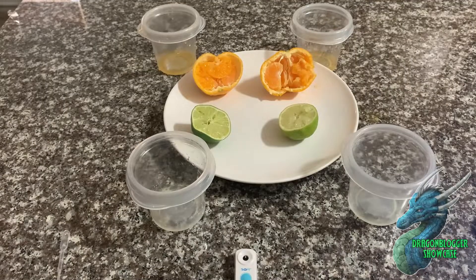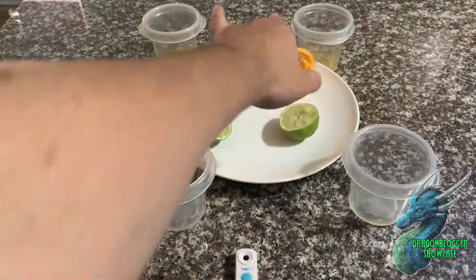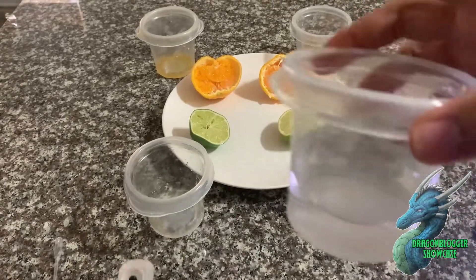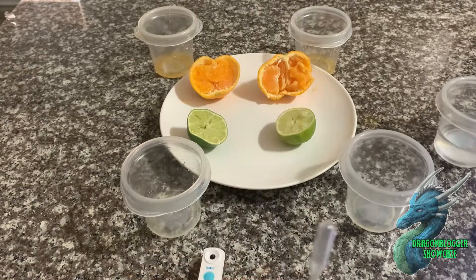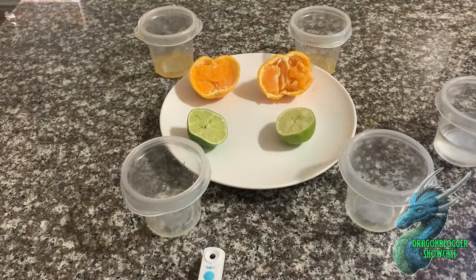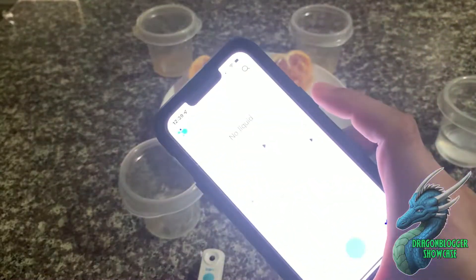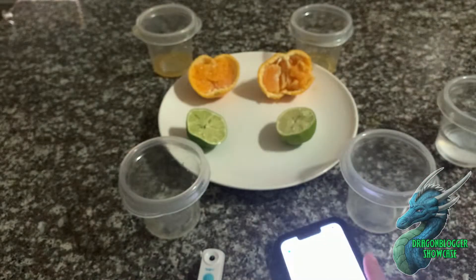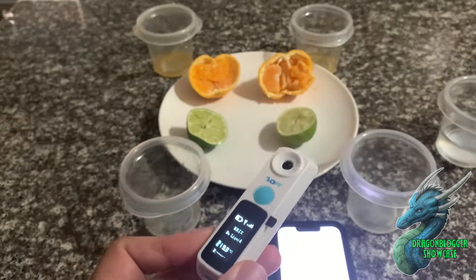I've got all my respective fruits cut up. This is the ripe lime, this is the less ripe lime, and these are my two satsumas in the back. I've already calibrated it — you just need some clear water and use the pipettes to calibrate it. Now I'm going to use the pipettes to test each one. I also have it connected to my app, which means I can show you how to test from there too, since you don't have to press the physical button on the refractometer itself.